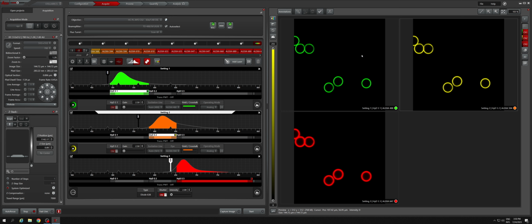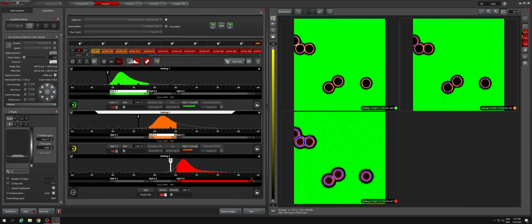And usually I just do this by eye, by looking at it, to see how bright it is and if it's suitable. But you can also go to this button, over under saturation, click on that. And so in this case, you'll see that there are some blue areas, and the blue areas are the bits that are still overexposed. The green is underexposed, that's the background, and the areas that are correctly exposed will be like white, yellow, orange colors. So I'll just decrease those first two a little bit.